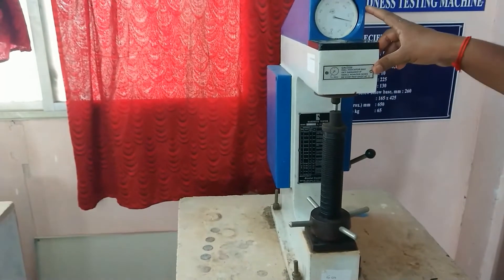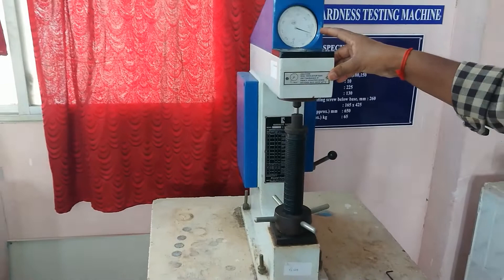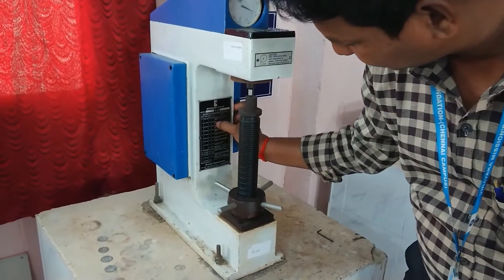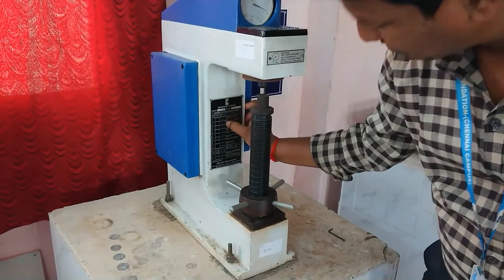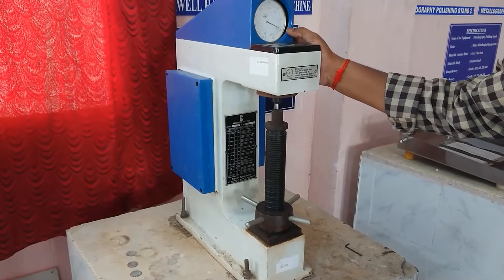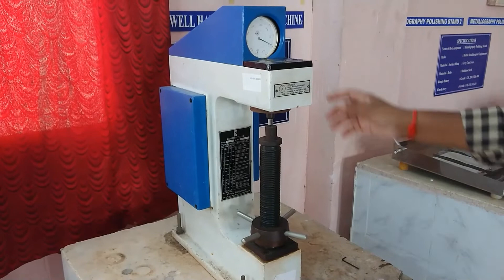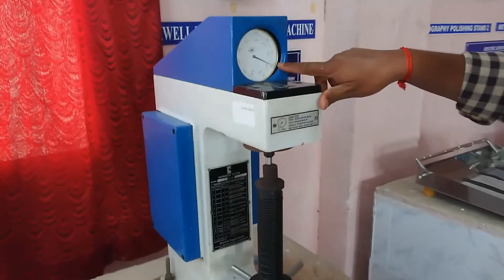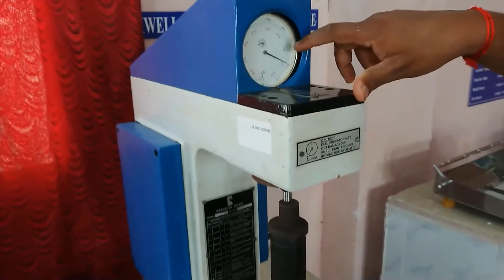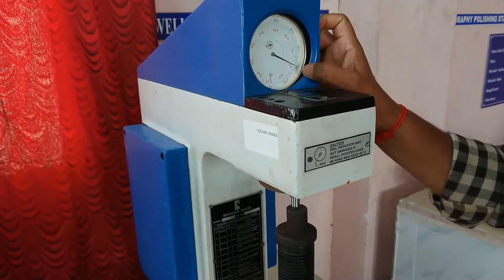Now look at the dial — what value is indicated is called the hardness number. Since we are using a diamond indenter with 150 kgf load, we read the black dial. The black dial reading is 79, which gives us the HRC value. The red color dial is used for HRB. So here we read the C scale.